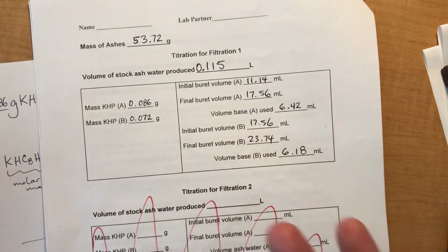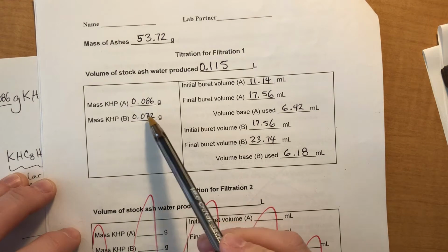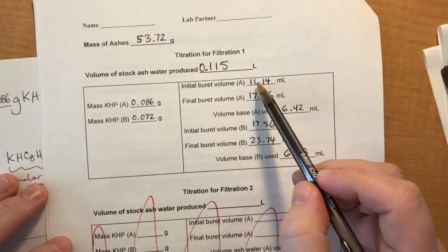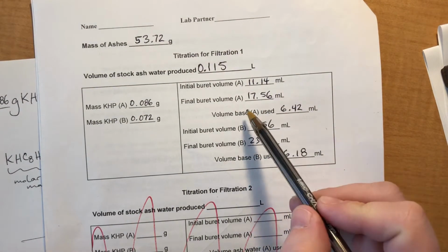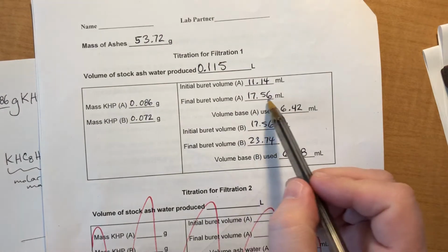You should just have these numbers. These are what you experimentally measured. Your values are supposed to be between 0.07 and 0.08. I picked a number slightly outside of that range, but it doesn't really matter for this. You have your initial volume of your KOH that was in the burette, to 2 decimal places. And then you titrated it until it turned that light pink color, and then you measured the final volume.